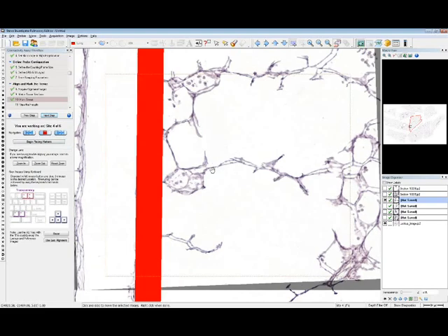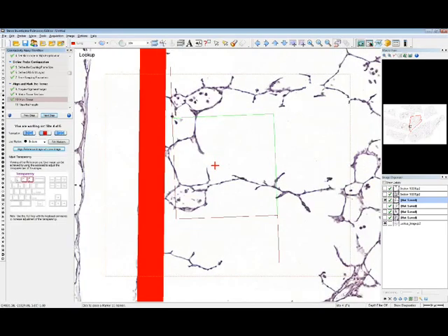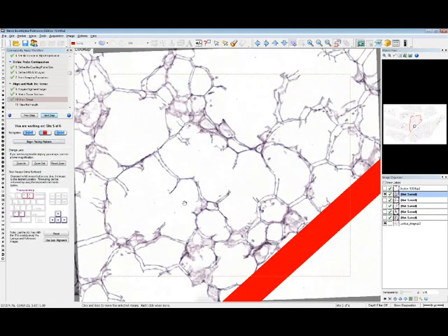And now I'm going to go line this up again. Again, once we're done, we're going to put the new counting frame on. We'll switch back and forth. Looks like there are no new bridges here, so we'll proceed to the next frame.